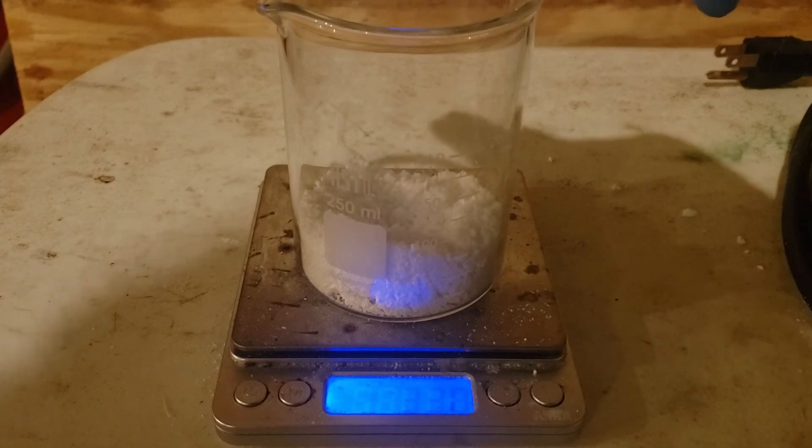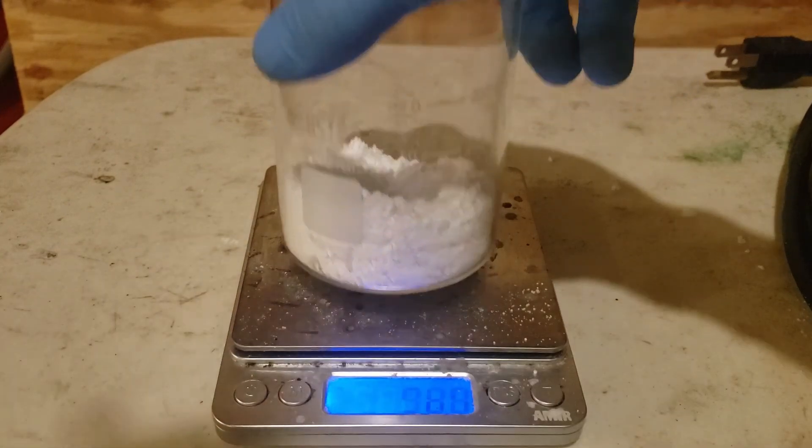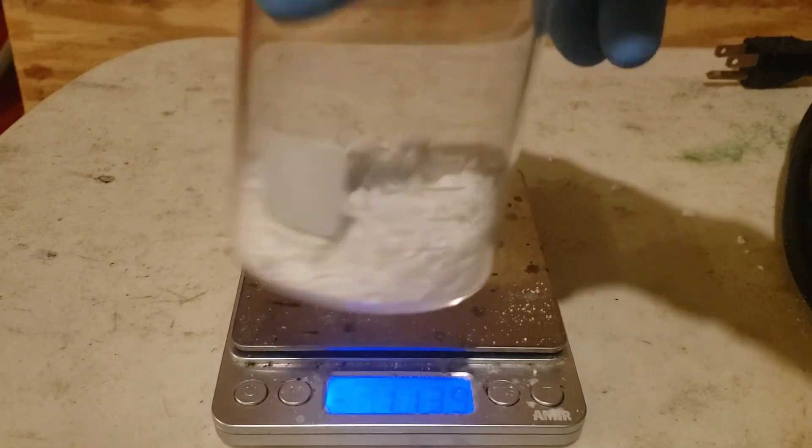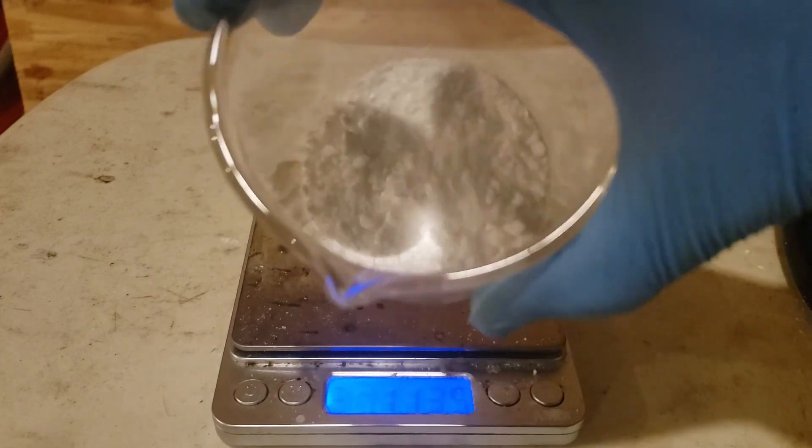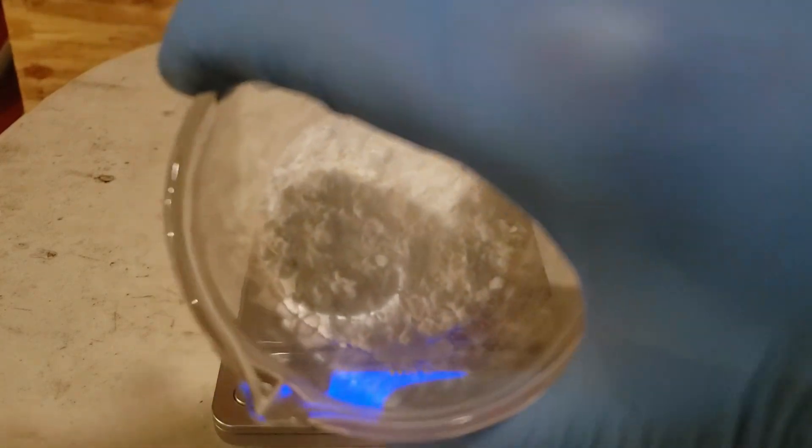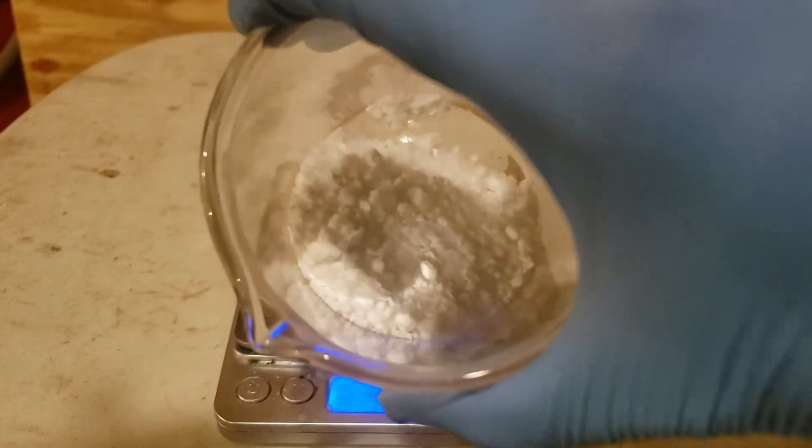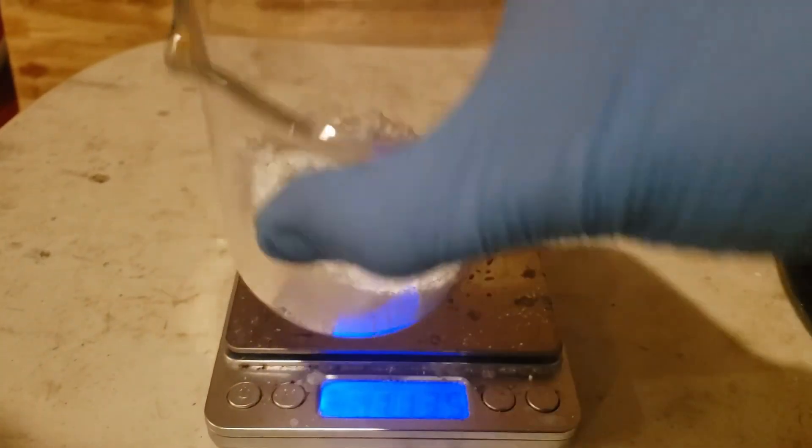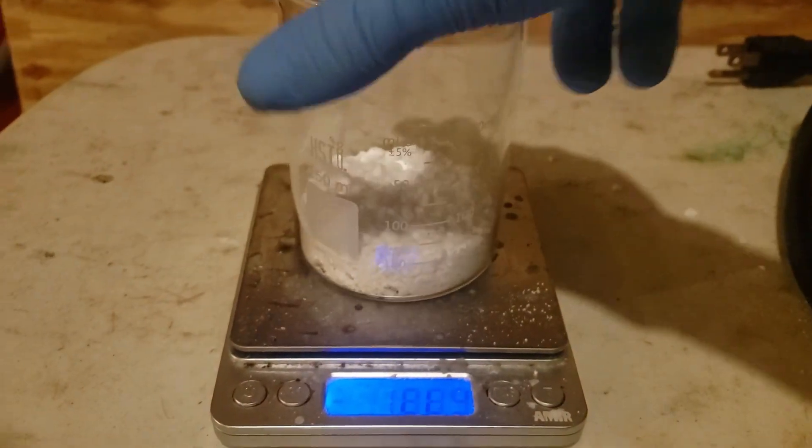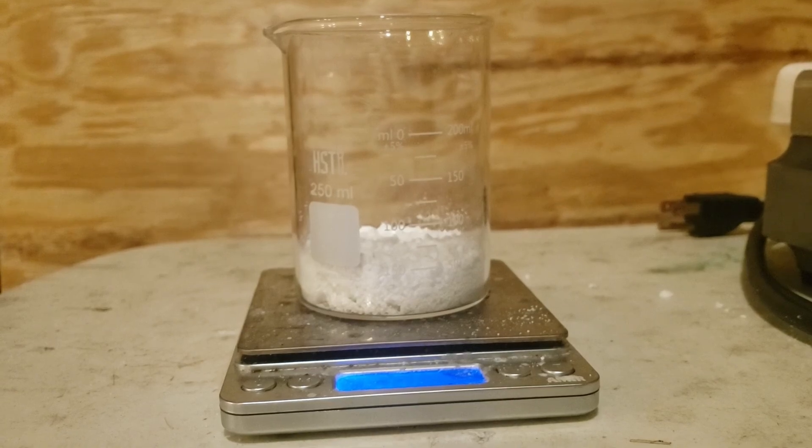I'll be using the boric acid in a future series, a long time away from now, where I make elemental boron, and in a video that's coming soon, I plan to look at this and many more chemicals under the microscope to observe their crystal structure.